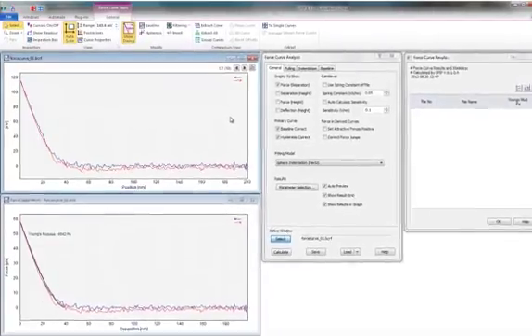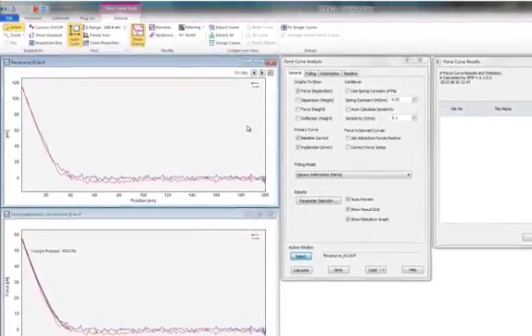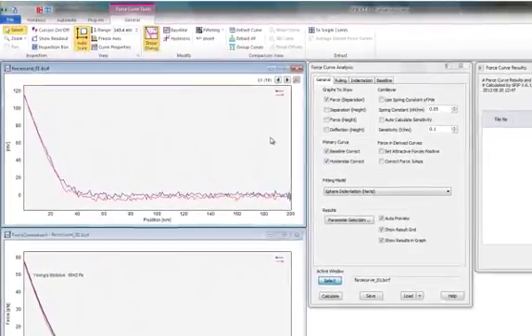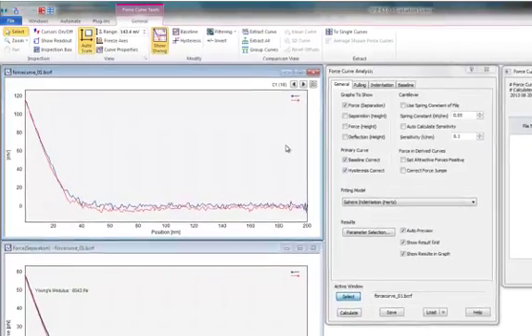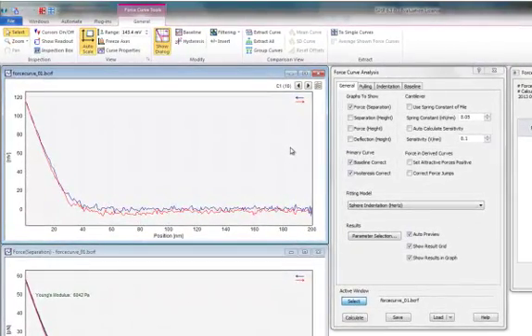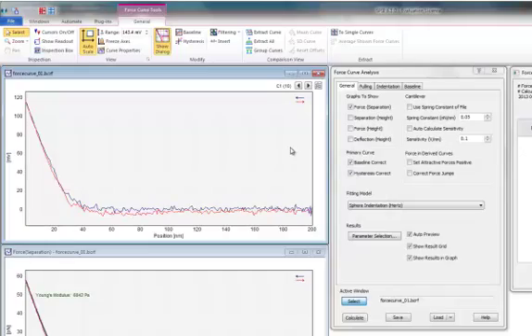This tutorial will introduce you to the force curve analysis in SPIP. In SPIP, you can analyze both pulling and indentation experiments.